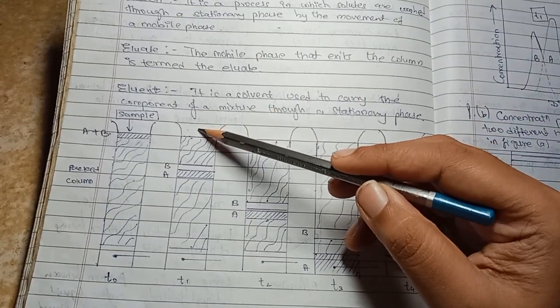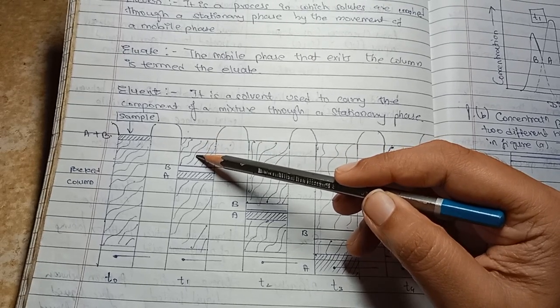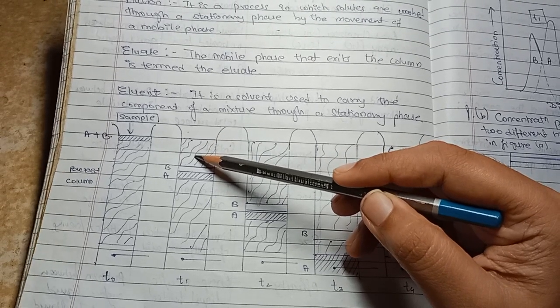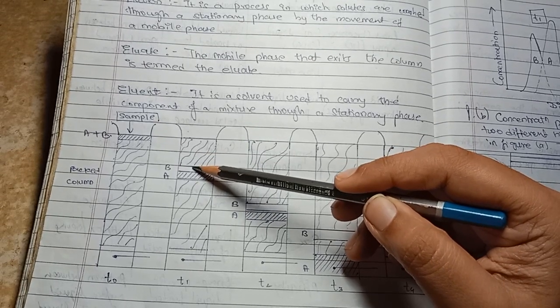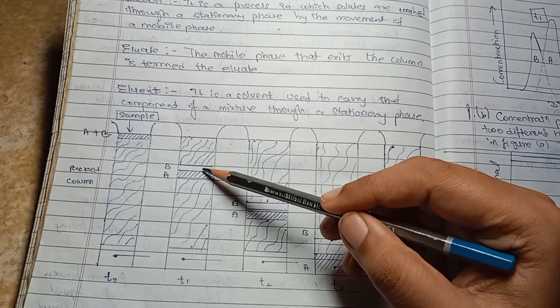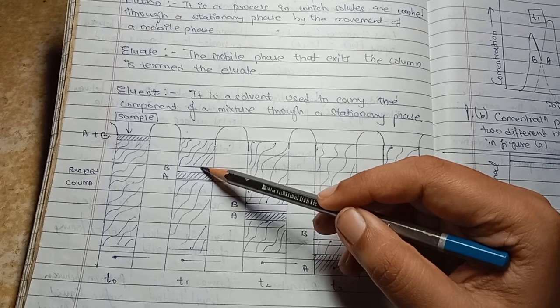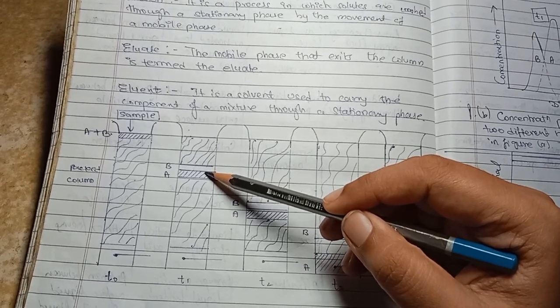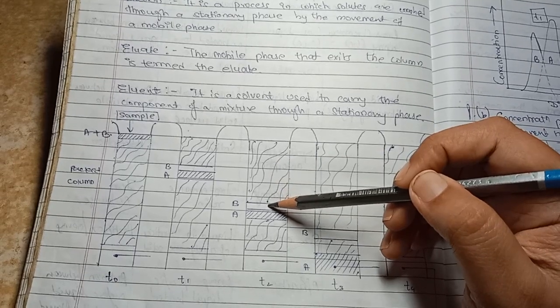Now once this mixture of components is absorbed by the solid phase column, at that time the mixture is divided. Can you see A and B? Both of these components A and B are separated.